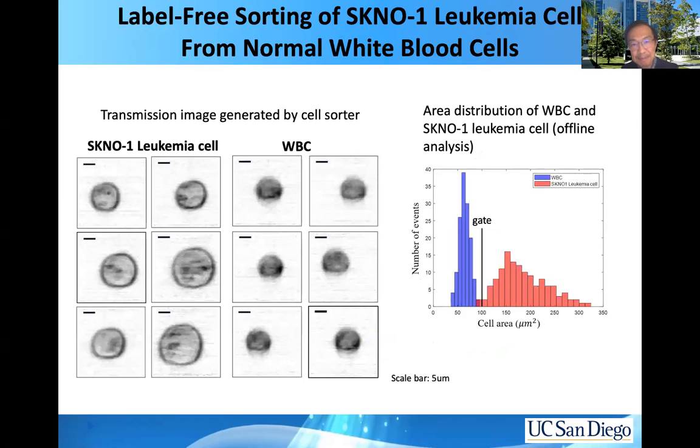Here is another example we could see: label-free leukemia cells versus white blood cells, and they certainly have very different spatial characteristics.